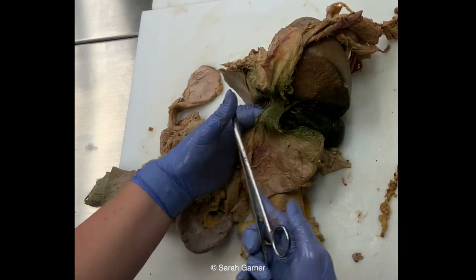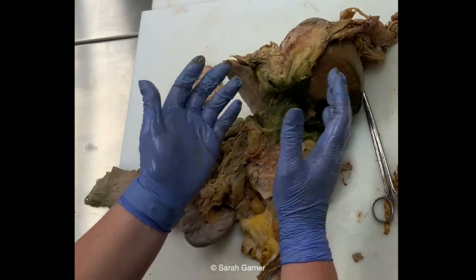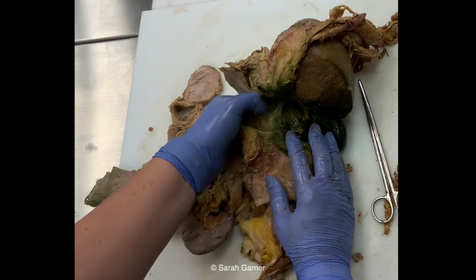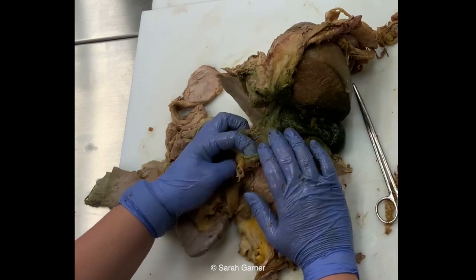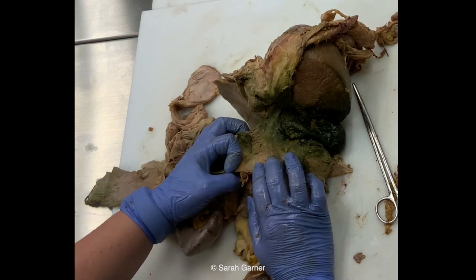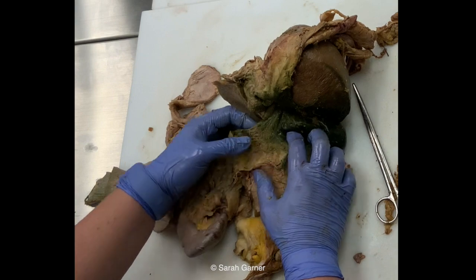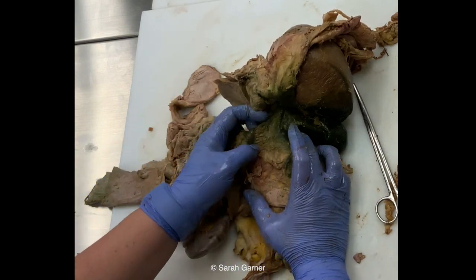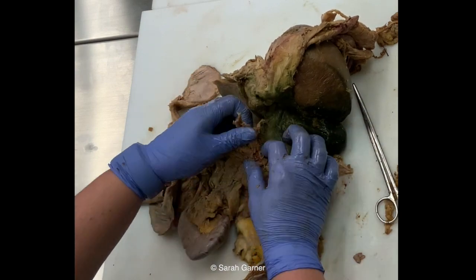So at the hilum of the liver, or the porta hepatis, you should be able to find your artery, your duct, and your hepatic portal vein. And so depending on what's going on, like say they had, I don't know, a liver transplant or something, you may need to inspect this very, very thoroughly. You should always inspect it, but keep in mind there might be pathologies where you would need to do a more thorough dissection here.